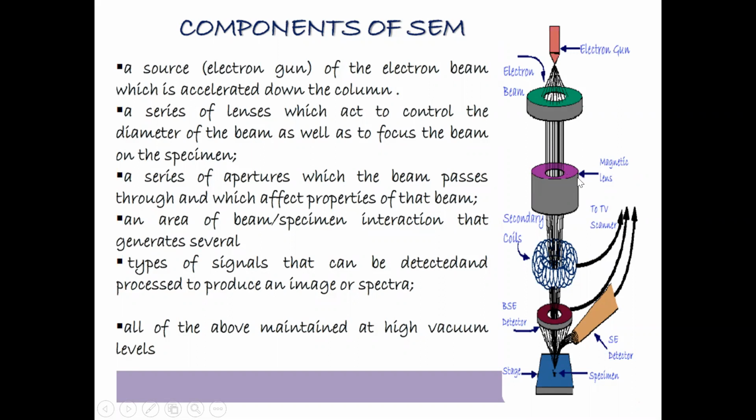Okay, instead of glass lenses, we are using magnetic lenses here because your electron beam should be straight while it is passing through this one, right?